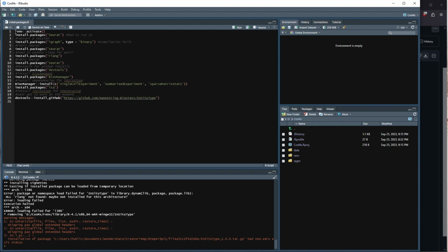I found out that using the R environment is really nice to get all your packages, make sure that the versions and everything are fixed for this particular project. So if you open up another project, we have conflicts, as you can see down here. I'm not able to get this last one installed, but I'm going to work on that, and I can share how I get that working.